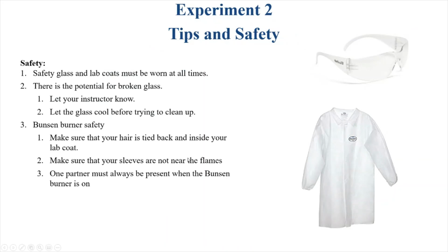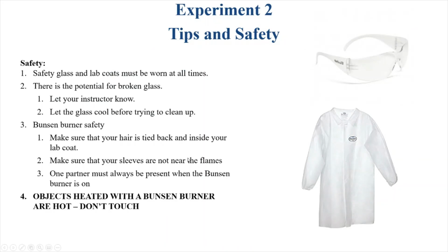Okay, so one thing I'd like to point out is, what are we thinking about in terms of safety? One of the components that will be a part of the quizzes and the exams in the lab is thinking about what we have to do for safety. You actually took a safety quiz already in Mastering, but in all of the experiments where we need to think about safety, I am going to point it out to you anyway, because you should be thinking about this as you develop experiments.